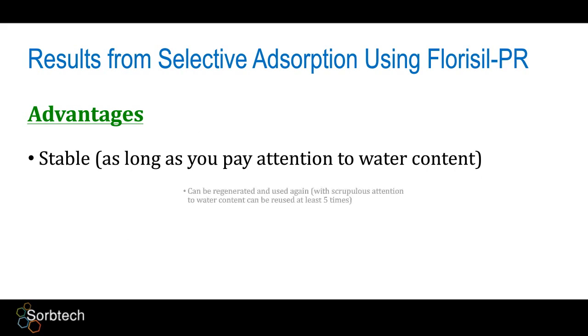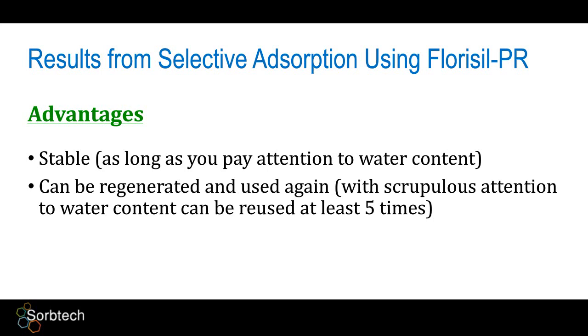attention to water content. It can be regenerated and used again with scrupulous attention to water content. It can be used at least 5 times. That's the only number of times that we've actually tested ourselves personally. Other people have told me that they can use it more often than that, but I haven't done it myself. And it's pretty easy to do. It's very easy to do, actually.